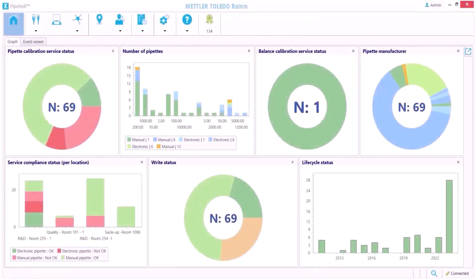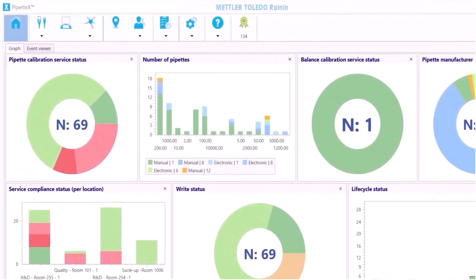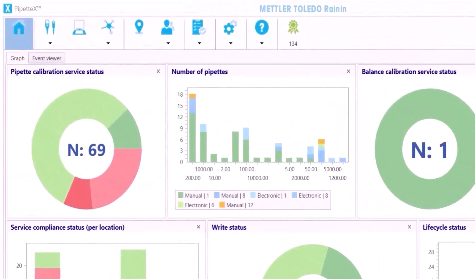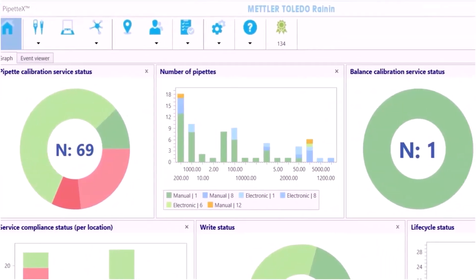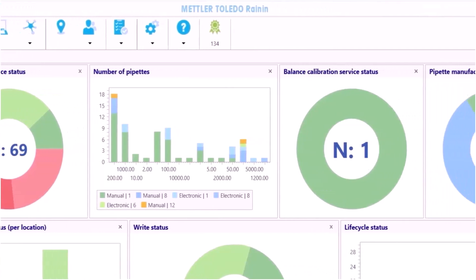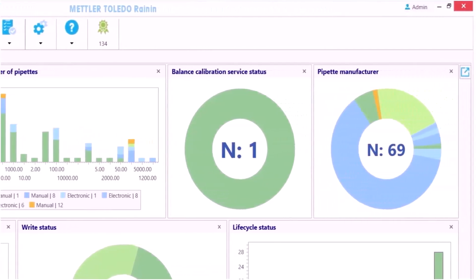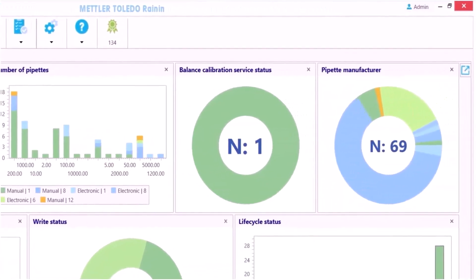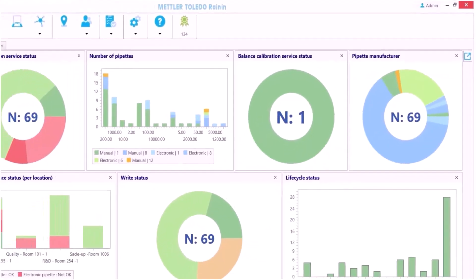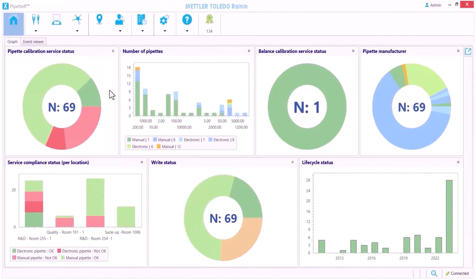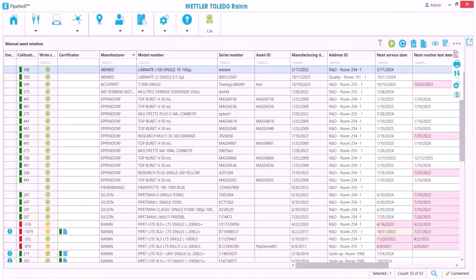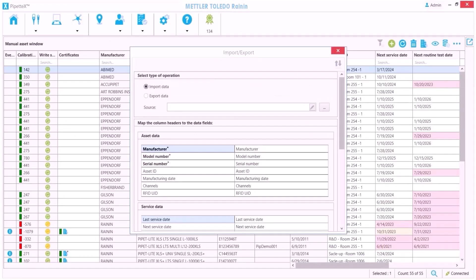This is Pipette X, a new more visual way to manage all your pipettes. It makes it much easier to oversee calibration status and compliance to keep all your pipettes dispensing consistently over time with high accuracy.